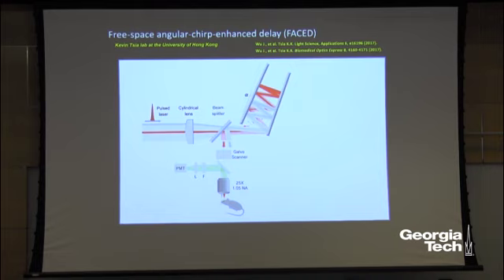And the different angle means that now it will form a focus at a different location inside the brain. But not only that, one way of looking at this is that you have a focal spot here, and by different numbers of bounces on the mirror, you will generate different virtual images of this focus. And these different foci will be at a different distance away from there.